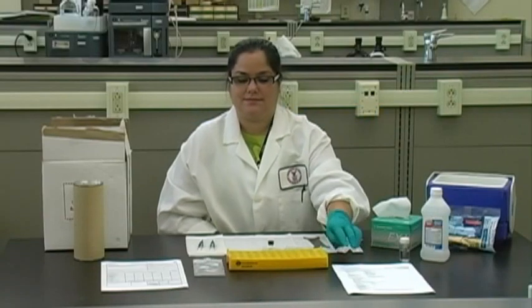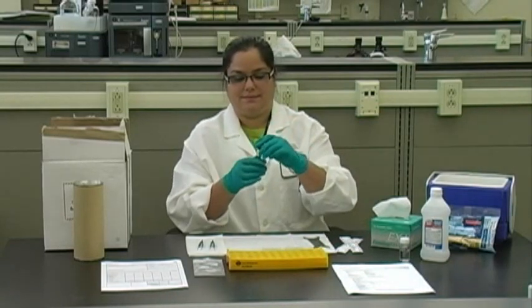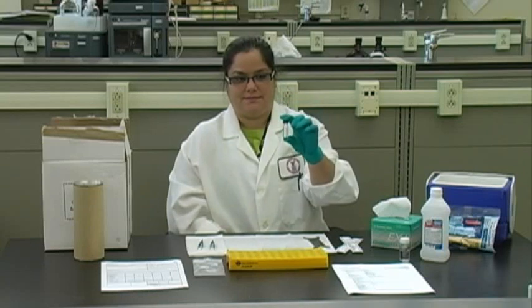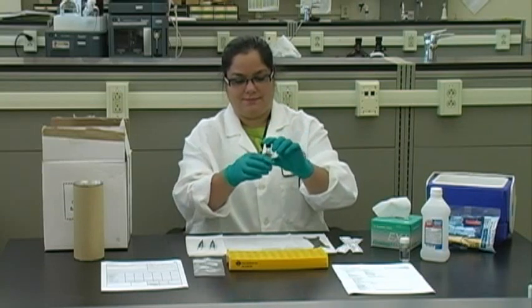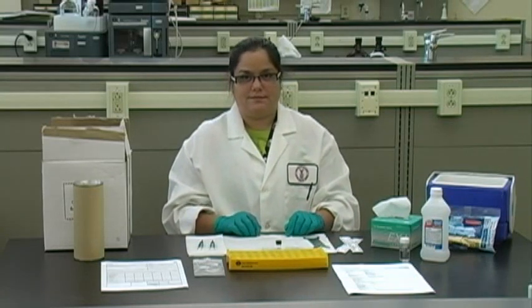This is the field extraction solvent and the container to which you will transfer your coated filter when you are done sampling. The glass vial contains 3 milliliters of a 90% acetonitrile and 10% dimethyl sulfoxide solution. Be careful not to spill any of the solvent because this will affect your sampling results.